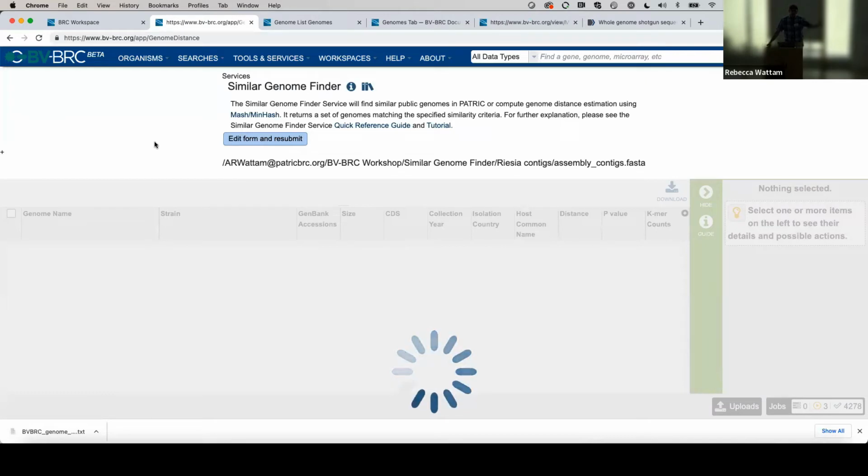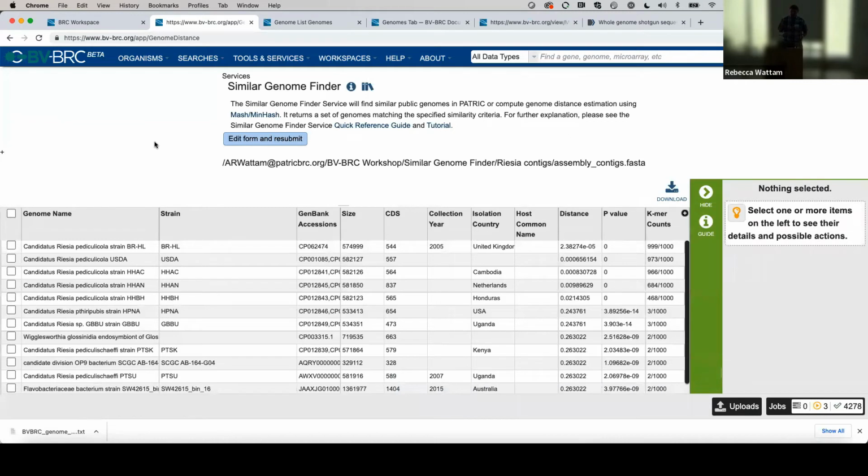I think Kraken looks at all k-mers, which makes it fairly slow. This speeds things up by having a clever way of making a random window into the k-mers, and that's controllable. You can control how big or small that window is, so you can control the speed. There is something clever about the algorithm, but it's kind of mathy, but some people are that way.